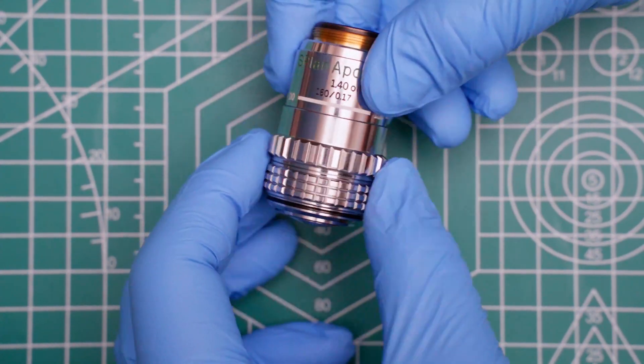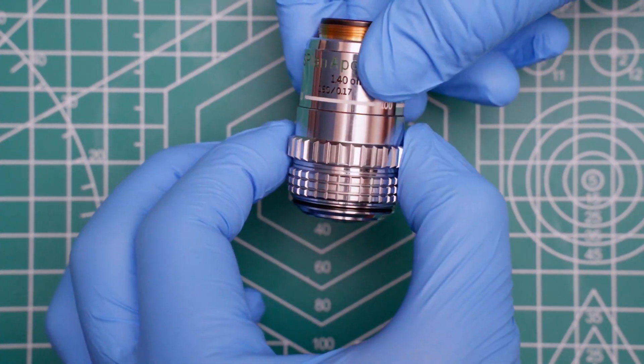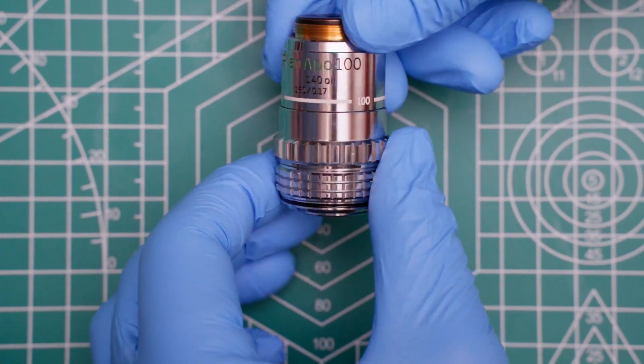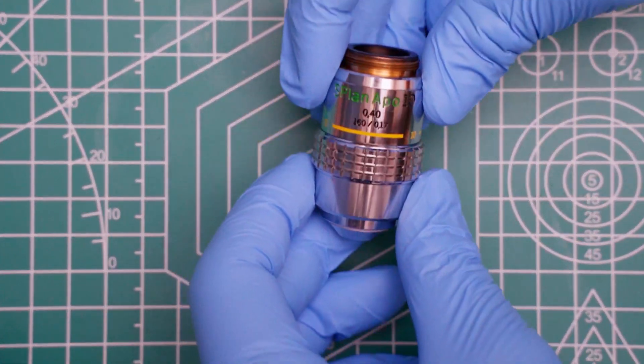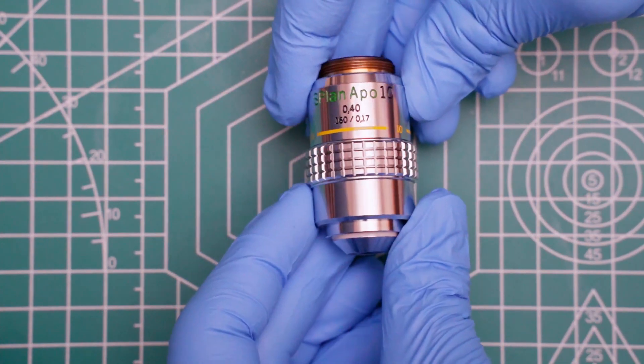Yes, if you have an amateur-grade microscope of reasonable quality, usually some kind of binocular scope with an adjustable Abbe condenser, there's a good chance that you can outfit it with some truly high-grade optics.